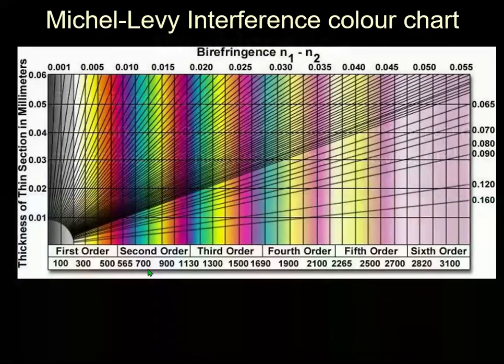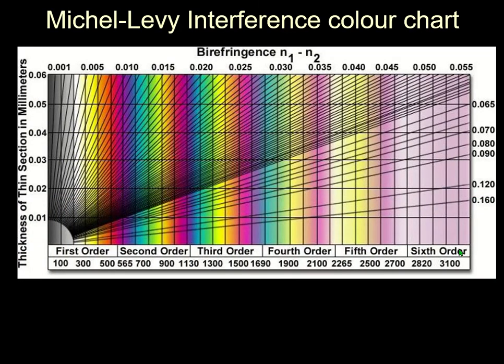And this is actually not a spectrum, it's several spectra. As you can see, this looks like a spectrum. It looks like a slightly more washed out spectrum. This is an even more washed out spectrum. And basically, the higher the order, the closer you get to white light. So when you have minerals with a refractive index, which can then give you their birefringence, this is the thickness of the thin section. This is very important. See, thickness of thin section in millimeters, 0.03.